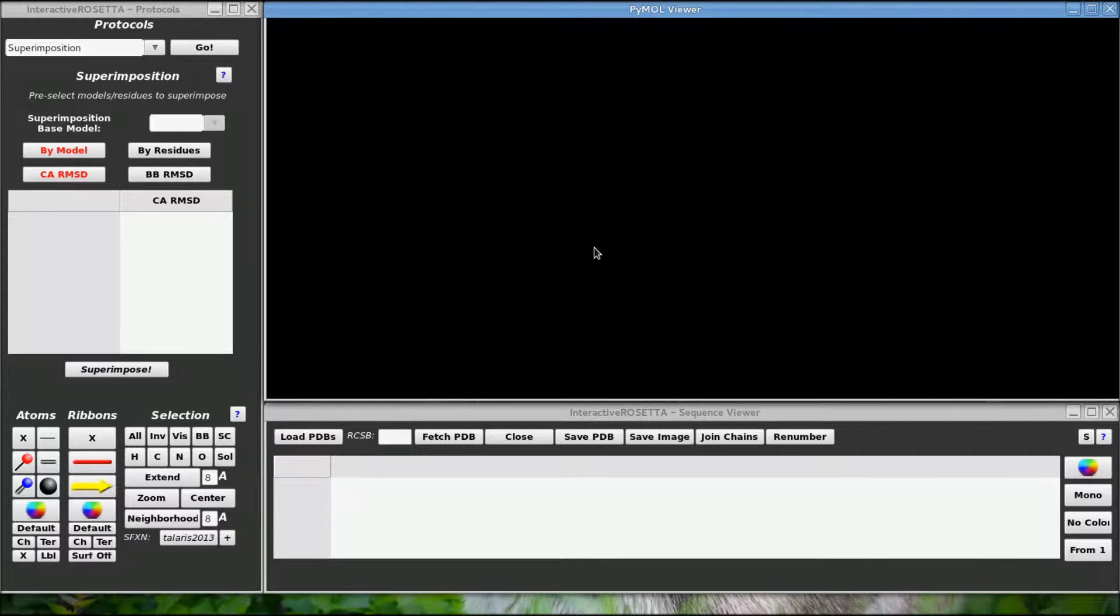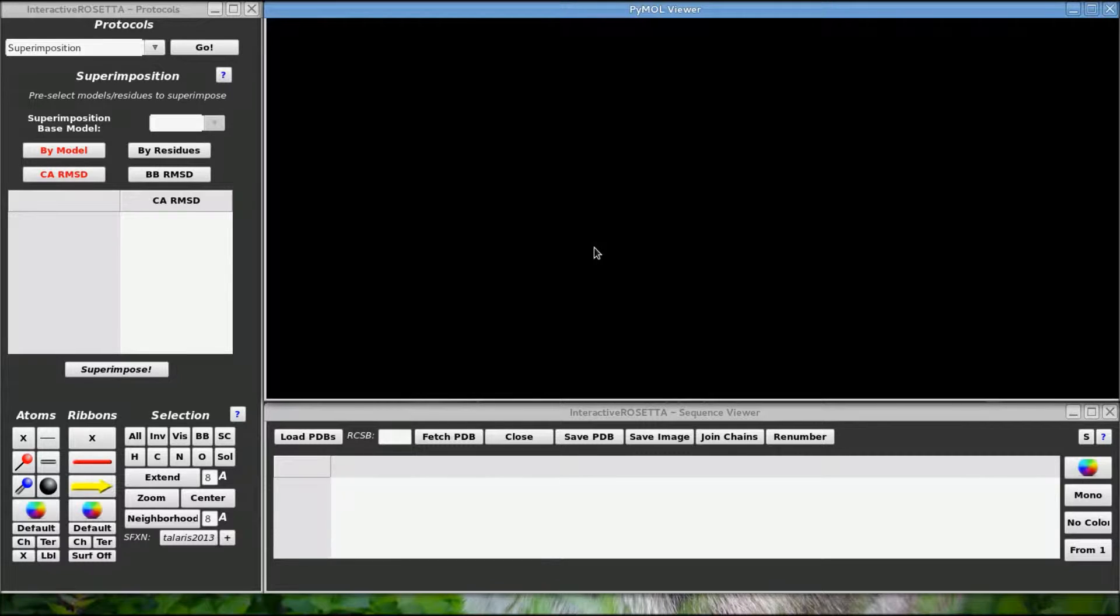Welcome everyone, today I will be showing you how to do loop remodeling in interactive Rosetta using the KICK protocol. With this protocol, you can sample different conformations of existing loops on your proteins or create new loops with new sequences from scratch.